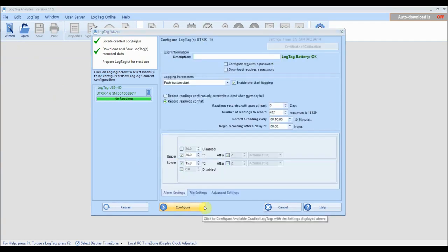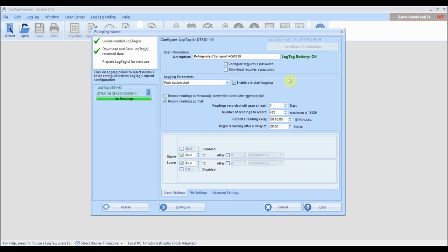Optionally, you can provide a description for your logger so it is easy to identify when the logger is next connected to LogTag Analyzer. You can also specify whether a password is required when the logger is next configured or downloaded to prevent unauthorized access.